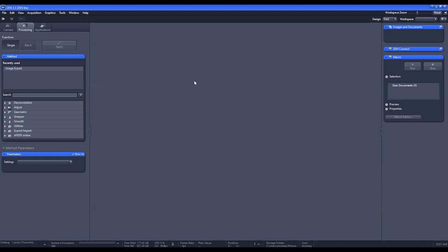This video is about exporting images from the Zeiss CZI file format into TIF using ZEN Blue. If you need a copy of ZEN Blue, we have the last version that could be installed from a single file, which is version 3.4, and it can do what we'll see here today. If you want, you can get the most recent version.